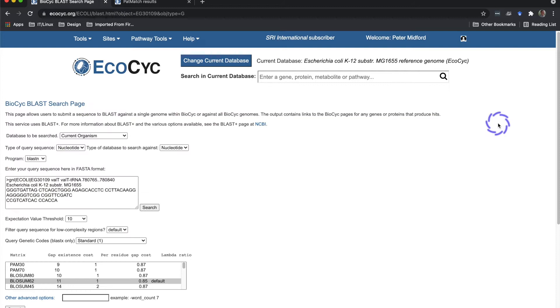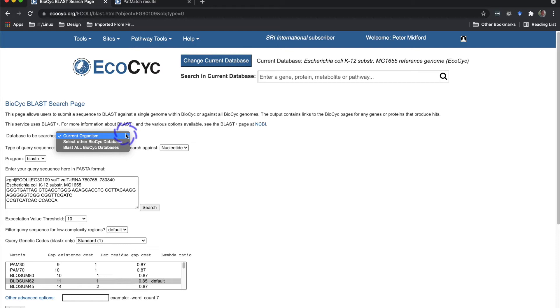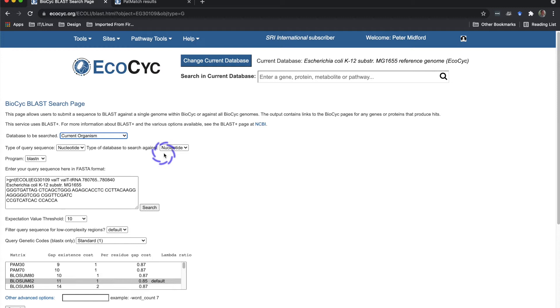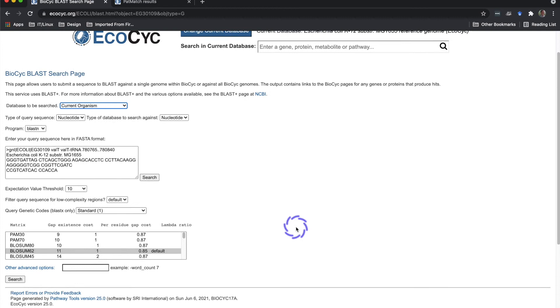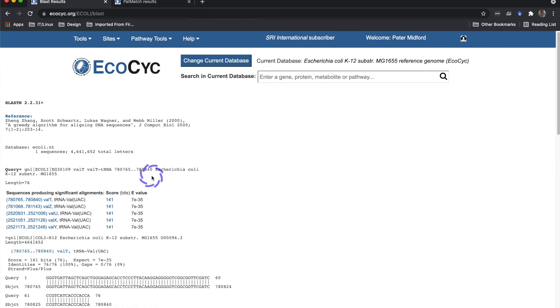It takes me to the BLAST search page with the FASTA for the gene sequence loaded into the sequence window. If I had started from the main menu, I would need to paste the sequence into this window. I can run the BLAST against a single organism, either the current organism, or I can select a different organism, or I can BLAST against all the biopsychs. I can specify the sequence type and what sort of sequence to BLAST against, and specify several BLAST search parameters. When I click search, it returns a report listing significant hits and links to the genes in these hits. Here we see a group of five identical duplicates of this tRNA for valine in different locations of the genome. So these BLAST results suggest that this gene has been duplicated relatively recently.